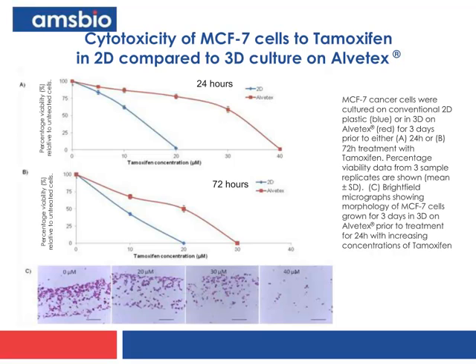The IC50s are 3 to 4 times bigger. So you can see in panel C that it's not that the cells are not dying eventually, but you really need much higher doses. And this is something that we know, that in the transition between flat plastic to tissue is different. So this was a very good indication that we're really getting in Alvatex structures that are more similar to the cancer that we are trying to study.